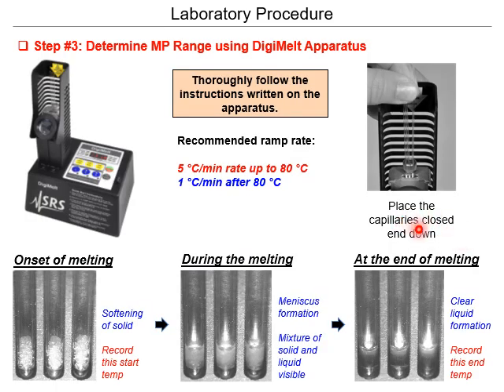After that, you need to use a Digimelt instrument to detect the starting point of melting, the initial temperature, and the end of the melting step. If you check the instrument during the heating step, when you see the first drop of melting of your solid, that's your initial temperature, the beginning of the melting step.